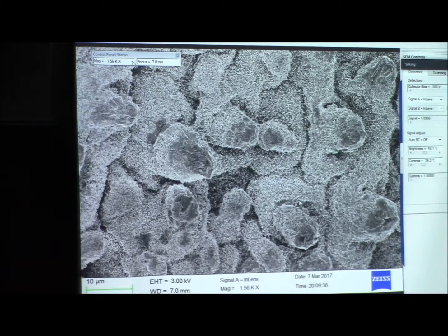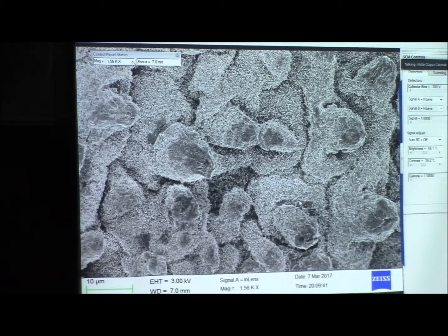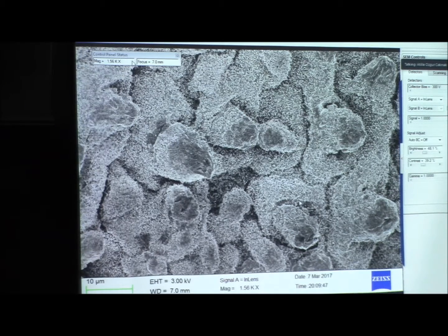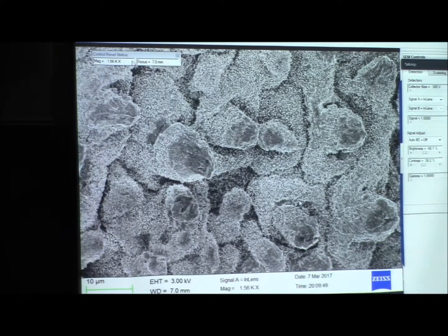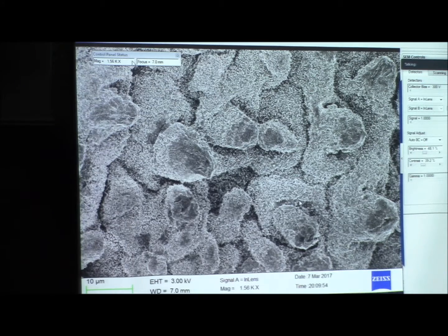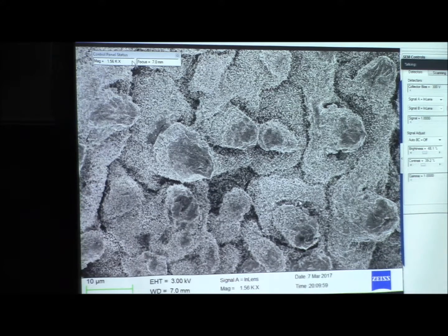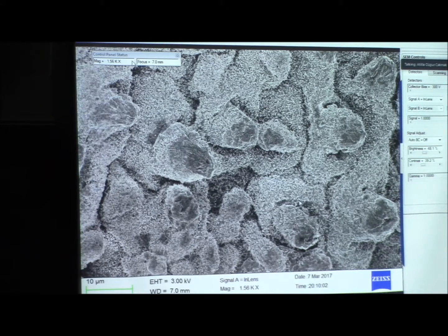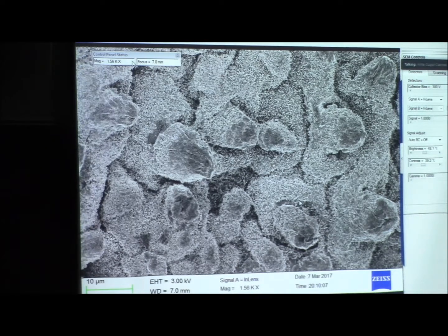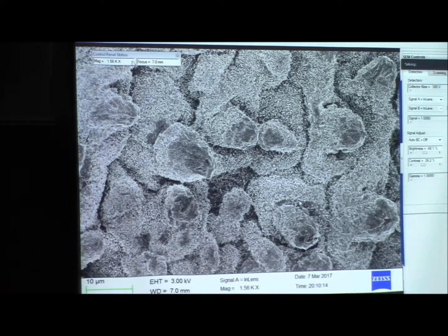So here at Penn State, we're running both in parallel. We're using this FESEM a lot to see what the students in our program are fabricating, their devices from lithography processes in silicon. And these tools are absolutely essential to not only fabricate, but to control and measure exactly the performance of these transistors.